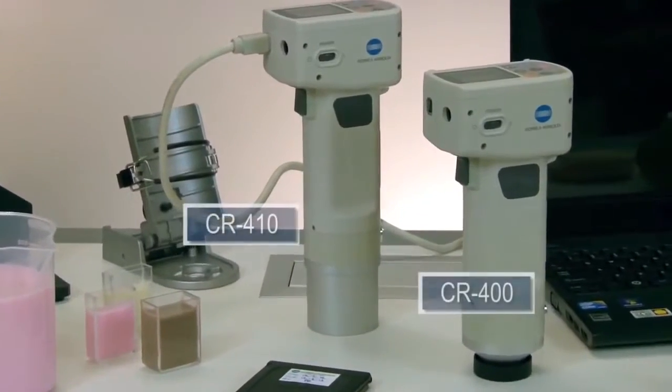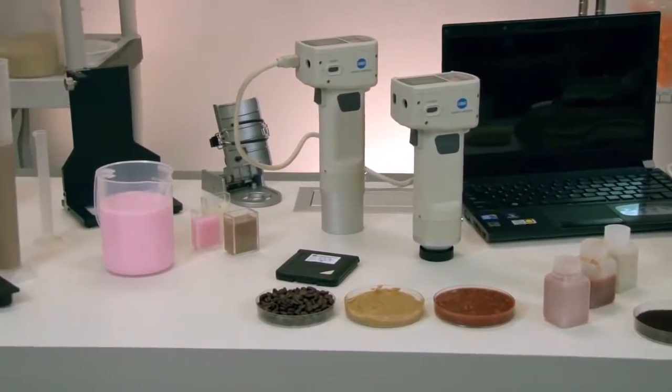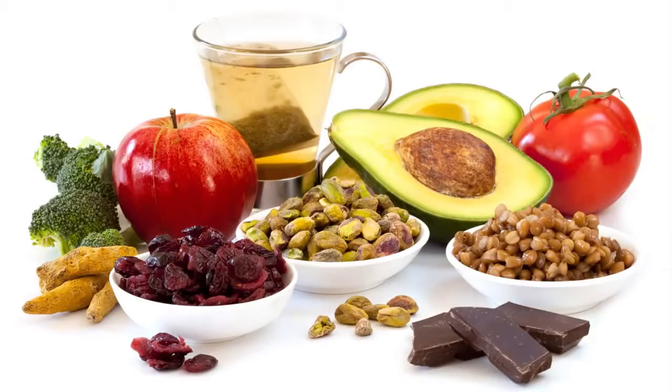Our best-selling CR400 and CR410 colorimeters are globally accepted as a standard for a wide variety of color control applications in paint, plastic, textile, ceramic, food, and beverage industries.